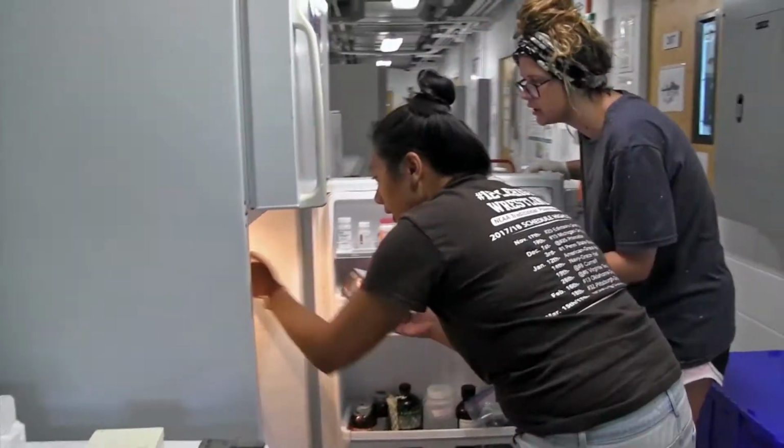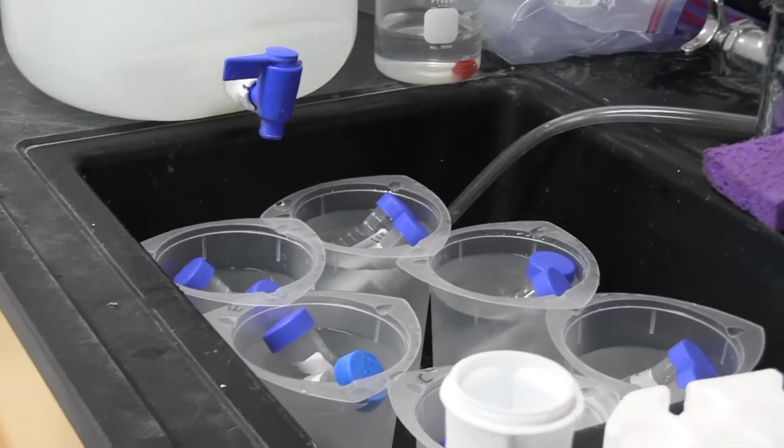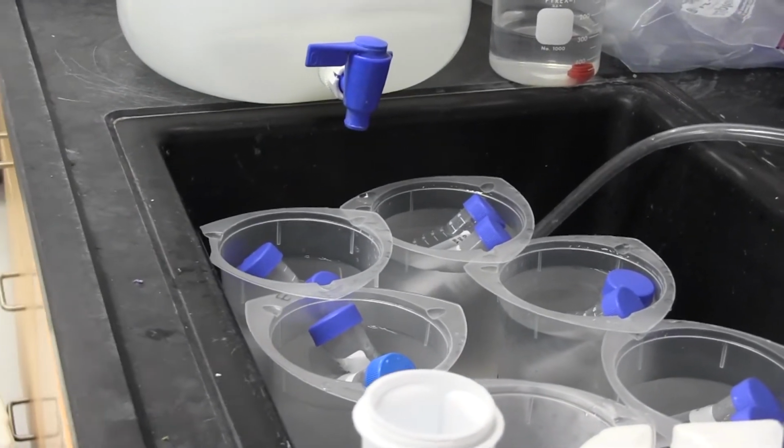So to start the process, we first need to thaw the samples if they're frozen and get them up to room temperature, because the formaldehyde that we fix it with is a bit like olive oil, so it has that funny, almost precipitate when it gets cold.